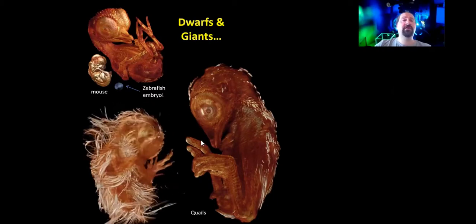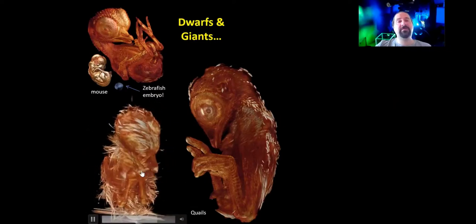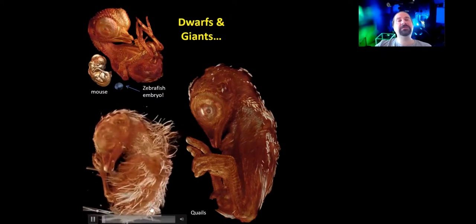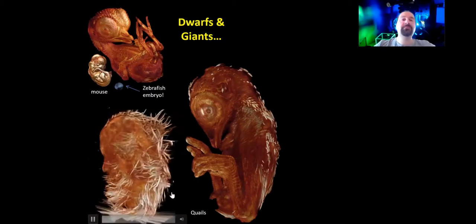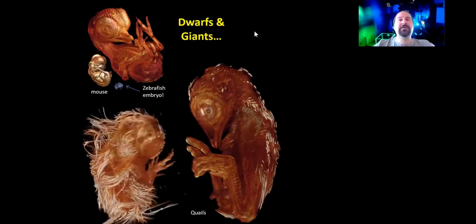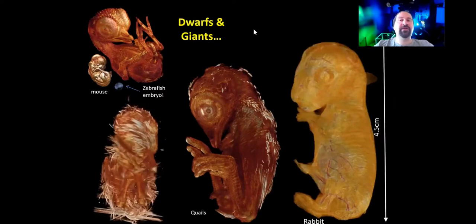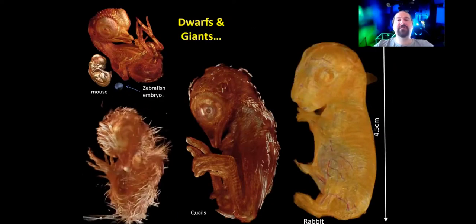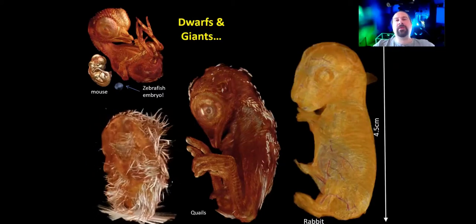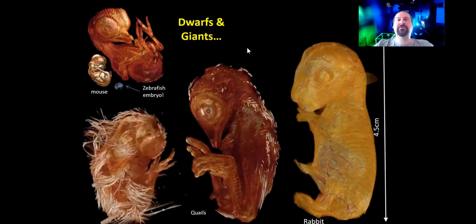And keep in mind that you do obtain images that contain all of the information inside these samples. So these are already 3-dimensional reconstructions done from the images. In this case, you see again a few artifacts from the fact that there were air bubbles in the sample when we mounted it. And then accidentally I was given this rabbit embryo, which I don't really know the stage. It's probably approaching term. And that beat my record. That went up to 4.5 centimeters.